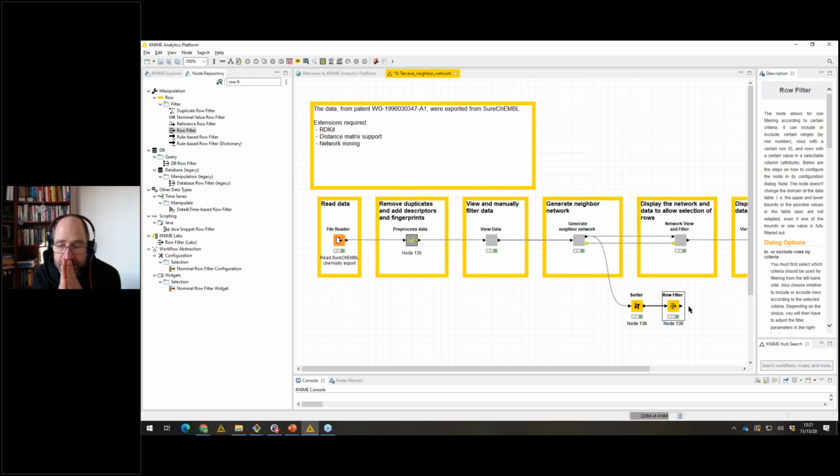I'm not very keen on Excel, to say the least. So could you maybe just show how to export to an SD file or write to an SD file?